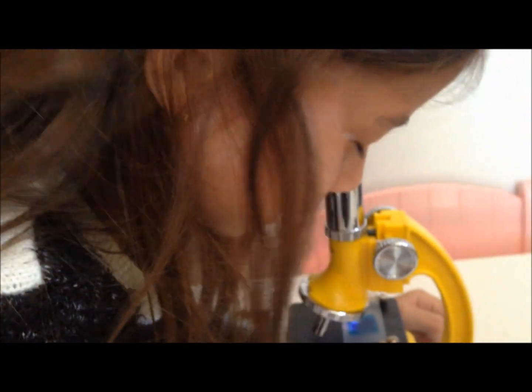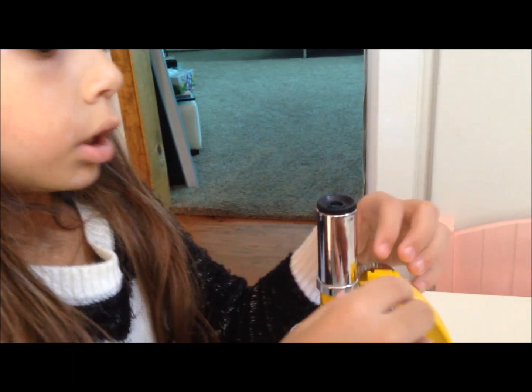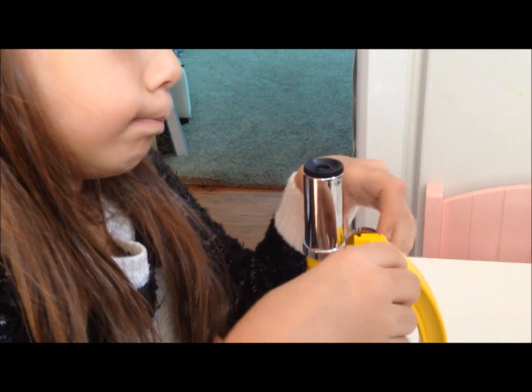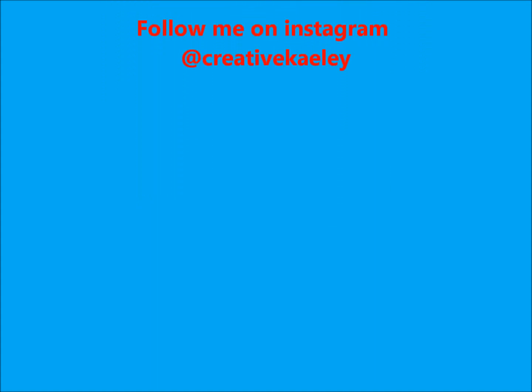I see blue. Do you see any cells there? I just see blue. Okay, you need to focus. Let me see if I can focus. See something? Do you see cells now? I just see blue again. I see cells.